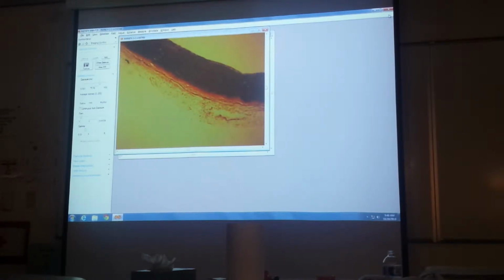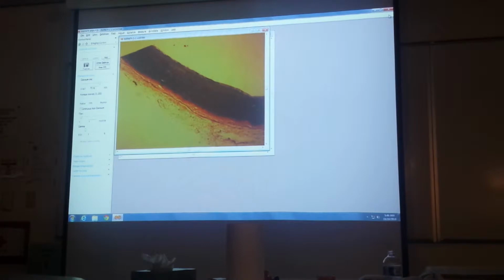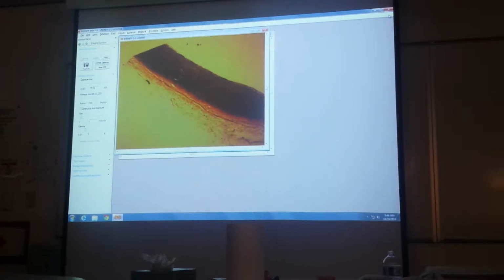So I think this is pretty good to look at right here. This is an elastic artery, and the three tunics. And when I point to this right here and I say identify tunic, what are you going to put? T-I. Oh, tunica. Tunica intima or interna. This whole thing right there is tunica media. Even the light pink part is still considered tunica media, but it has this dark appearance due to elastic tissue.